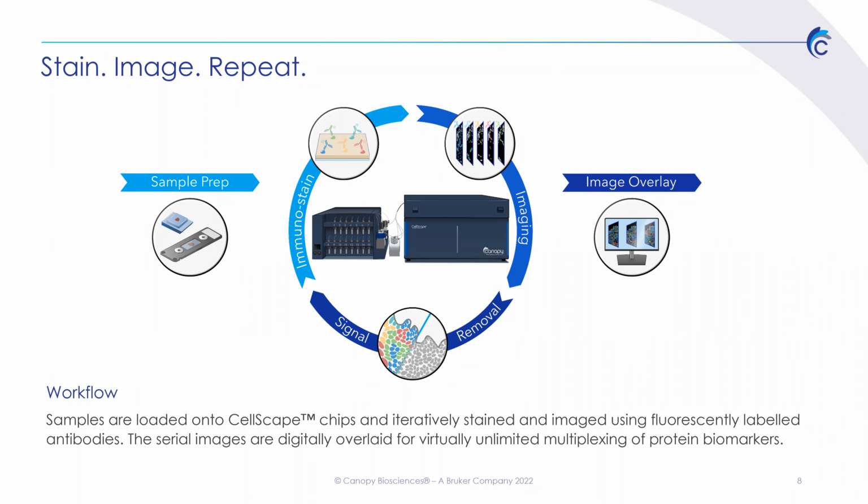So that's the idea. But again, what the photo bleaching allows us to do is use a much wider breadth of reagents. What we found is basically, it has to fluoresce: anything that excites in the UV vis, anything that emits in the UV vis, we've got to get those two, and anything that semi-readily bleaches is something that we can do. So we do a lot with primary conjugated antibodies, secondary antibodies, and so on and so forth. And even for things that don't bleach so well, because we're just using fluorescent reagents, there are lots of other tips and tricks that we can do in order to bring in reagents that maybe don't bleach.